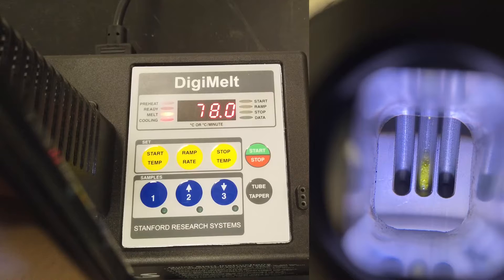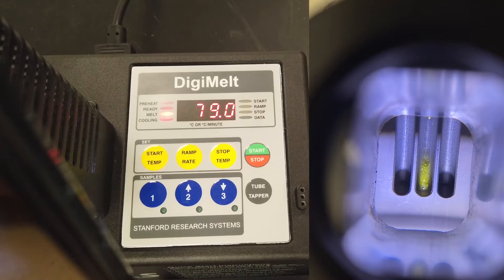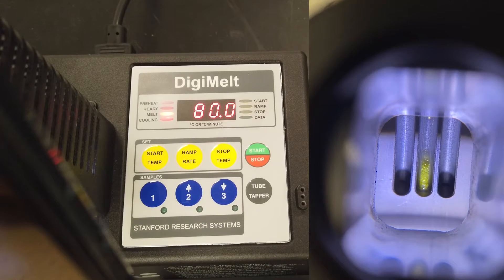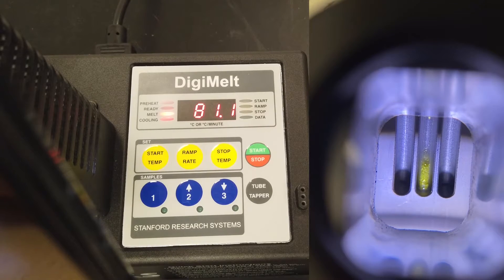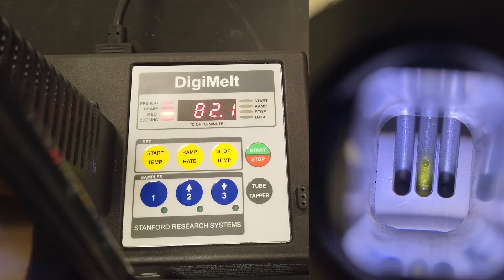Although the term melting point is usually used, what is meant is a melting point range. If the compound melts over a very narrow range, it can usually be assumed that the compound is relatively pure. If it melts at a wide range or at a lower than expected temperature, it can be assumed that it is relatively impure.